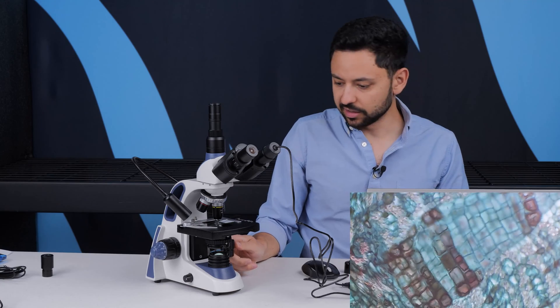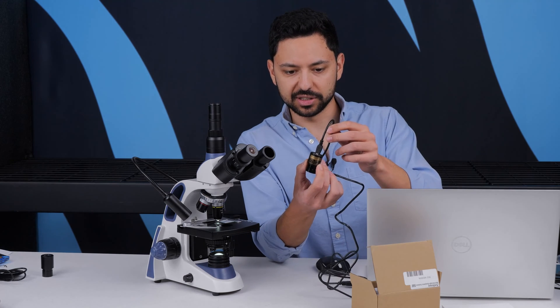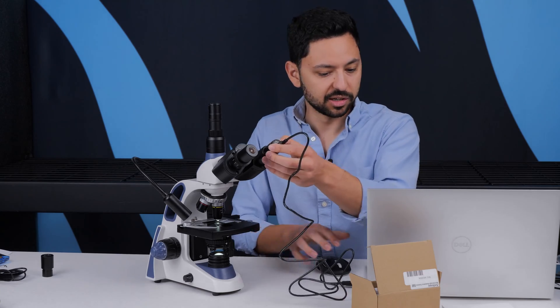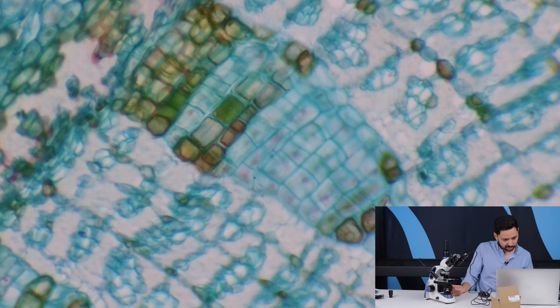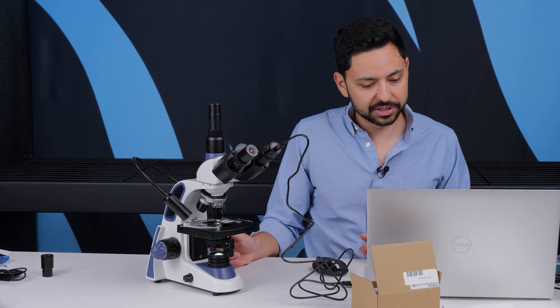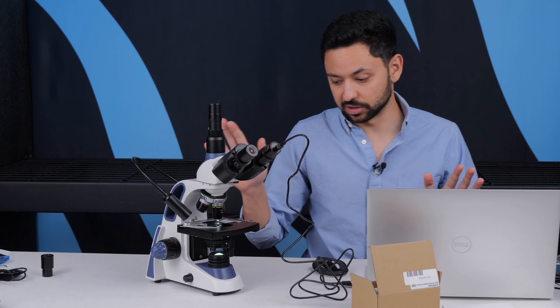This looks pretty good — the frame rate is definitely above 25, and you can actually see the nuclei on this sample. Here's another eyepiece adapter camera, this one from Amscope, purchased on Amazon for $120. I do like the quality of this one — it's nice and crisp, there doesn't seem to be much noise, the color accuracy is pretty decent, and the frame rate is good.